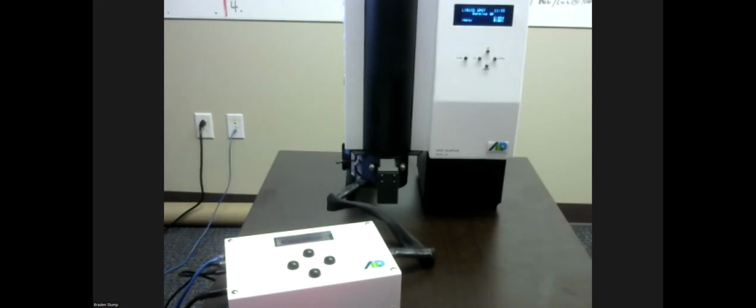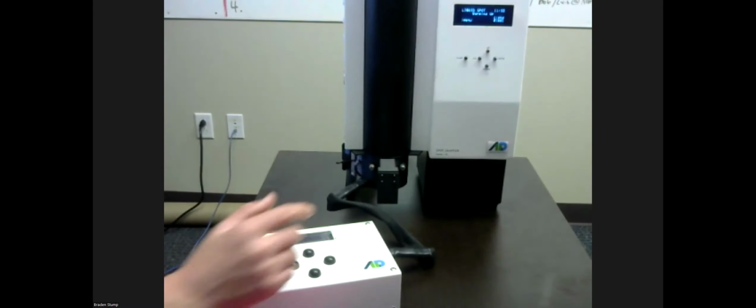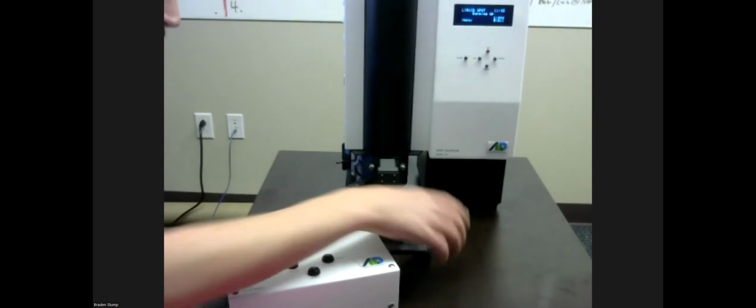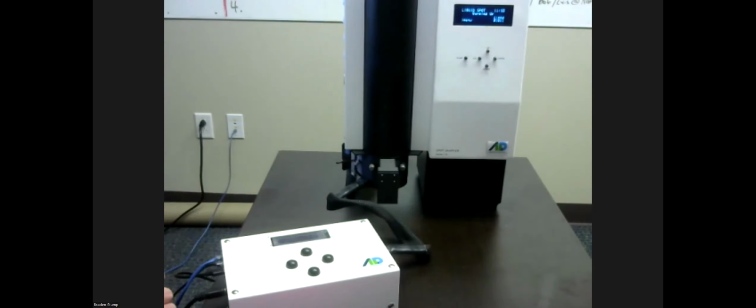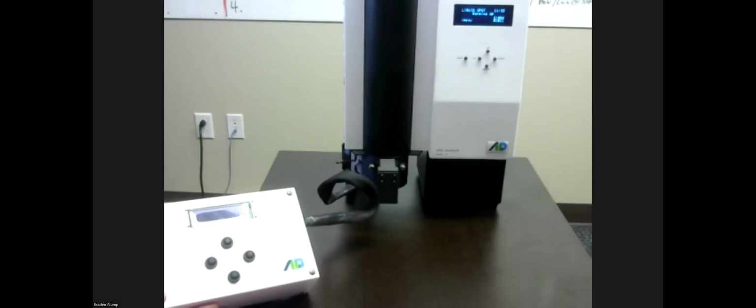Going to go ahead and turn the TLC on again. Once again, seeing the process of sampler on first, then TLC. As the TLC starts up, it will do a systems check to see whether or not a sampler is connected to it. So it's pretty important to make sure that this is ready to rock first.